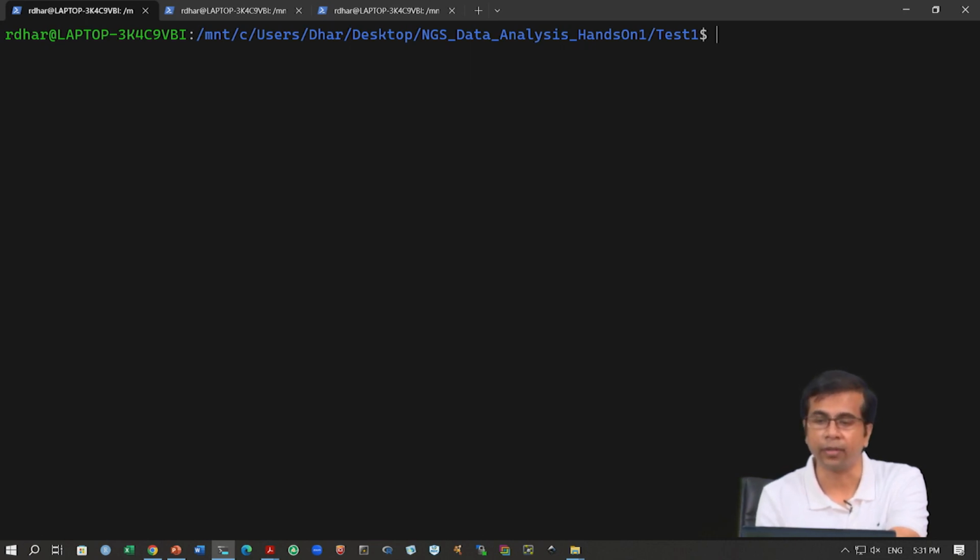If you are familiar with Linux, you will know this: there is a way to do this by adding it to the path. If you want to add this to the path, you need to have administrative access, meaning sudo access, and you have to modify this file which we will call bash profile.